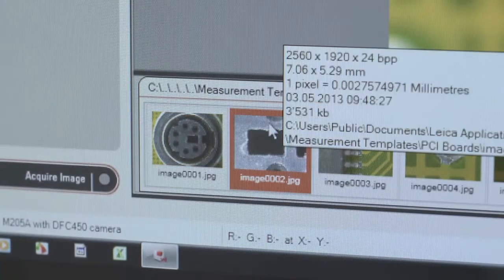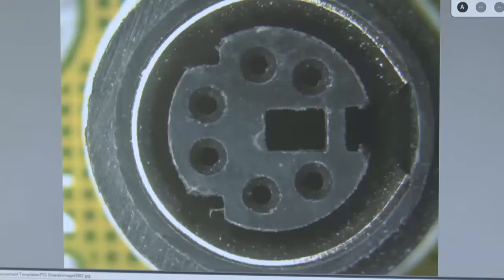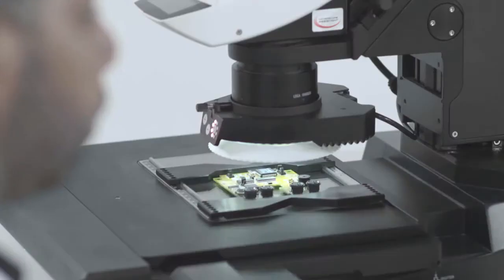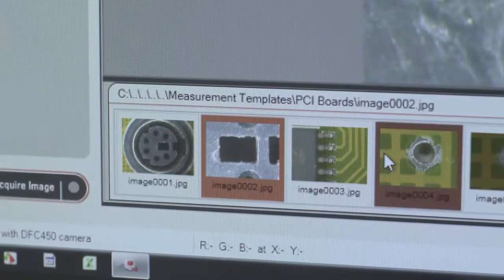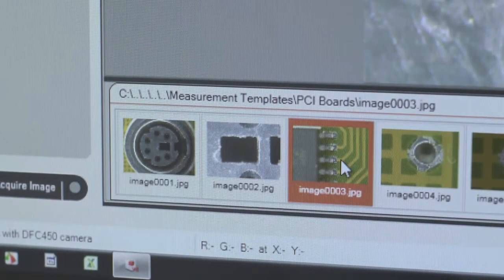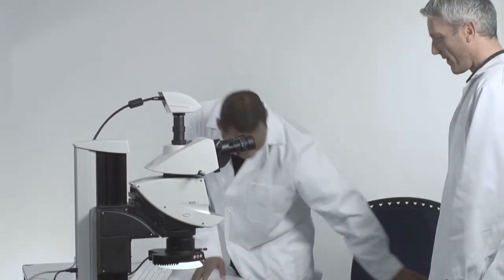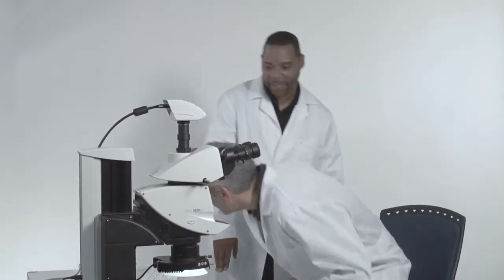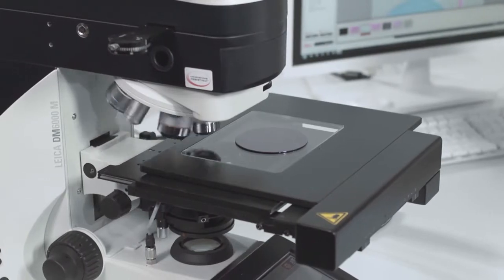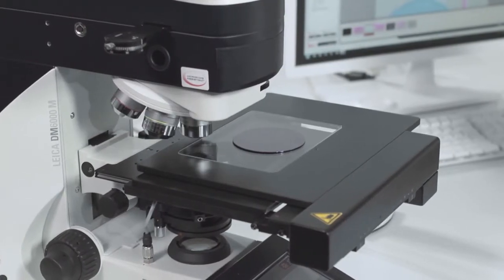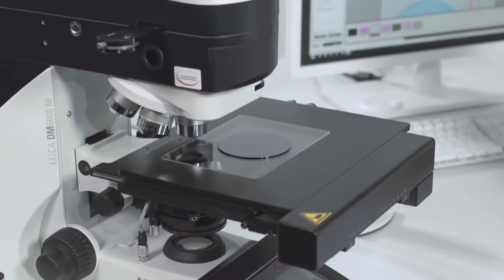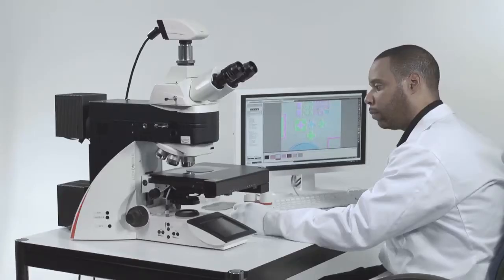With one click you can recall all microscope, camera, and illumination settings. Simply select the reference image and the microscope assistant will do the rest for you. Ideal for multiple operators — recurring tasks were never faster and easier to solve.